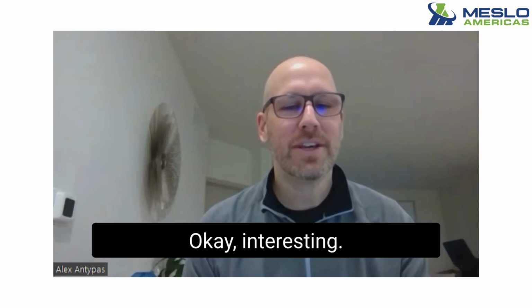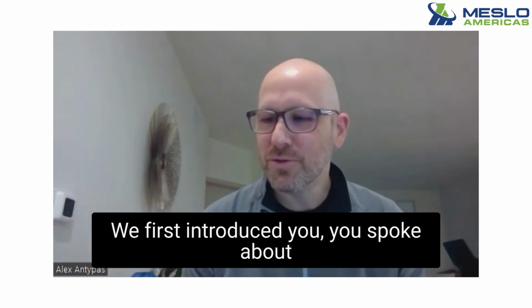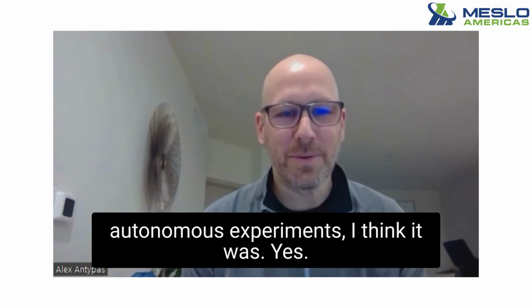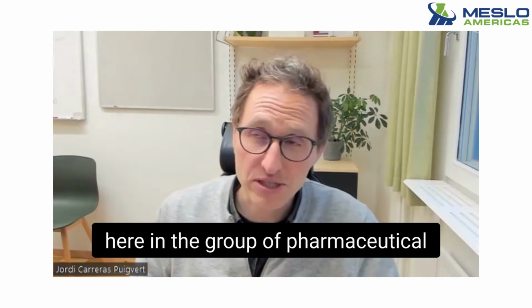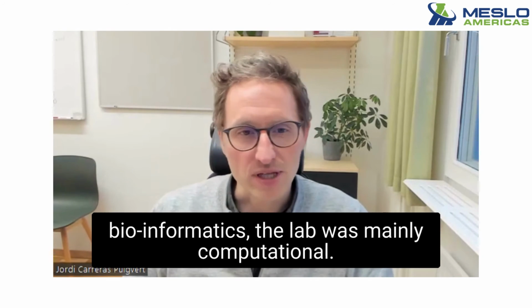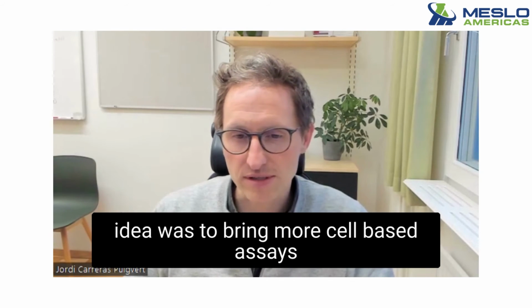Okay. Interesting. So Jordi, I'm interested to go back to what you first spoke about when we first introduced you. You spoke about autonomous experiments, I think it was. Yes. So I'm interested to hear a little bit more about that. Yeah. So before I joined the group of pharmaceutical bioinformatics, the lab was mainly computational, and then when I was recruited, the idea was to bring more cell-based assays.